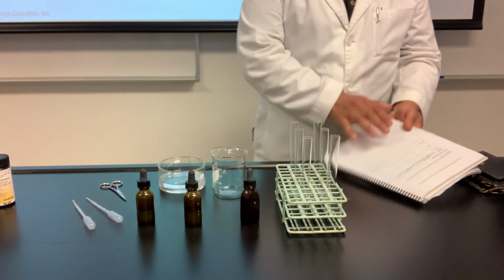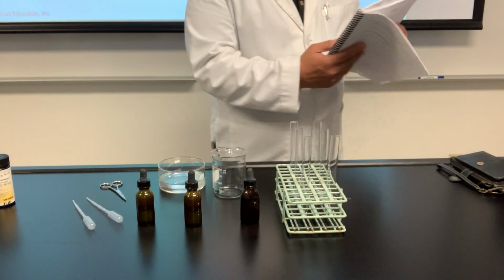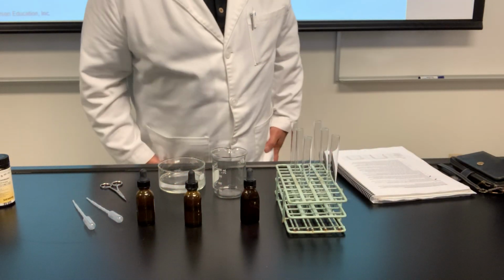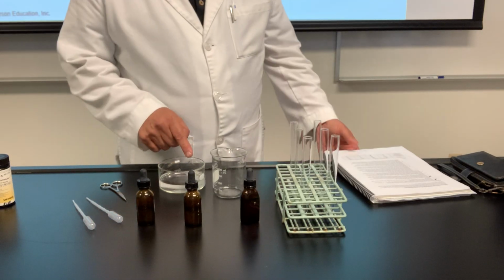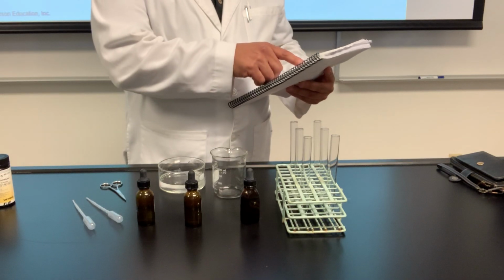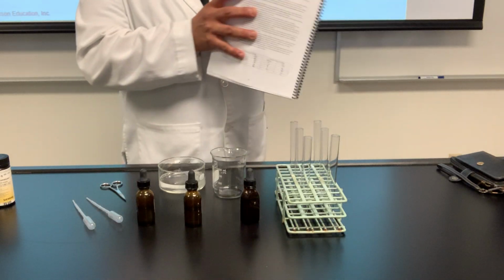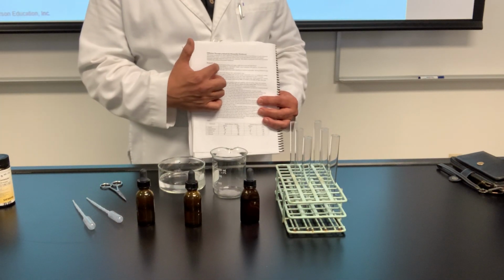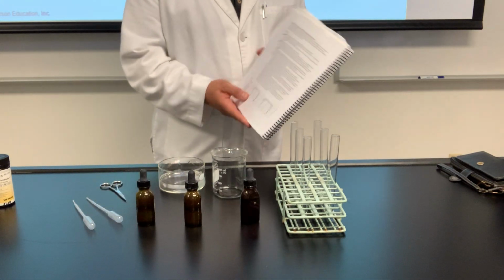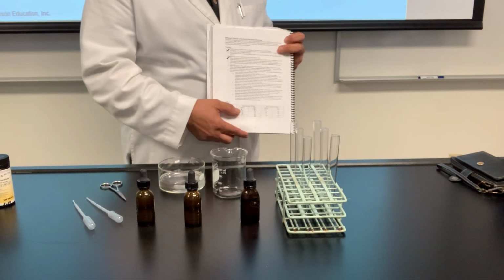In your lab manual on page number 52, procedure step 2, it tells you what's inside solution A. Inside solution A, which is inside the bag right now, is glucose, starch, albumin, which is protein, and sodium chloride. In step 5 of the procedure, it tells you what's in solution B. It's only sodium sulfate.